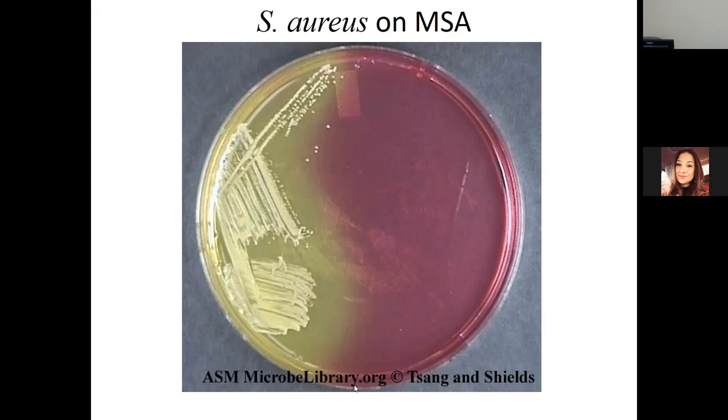So our wound setup would be blood agar, okay? MacConkey, because we don't know if it's gram negative or gram positive. We'll do PEA, we'll do mannitol salt, chocolate agar, and then a thioglycolate liquid media at the end. Plus a Gram stain at the beginning. So I like to do that whole shooting match.